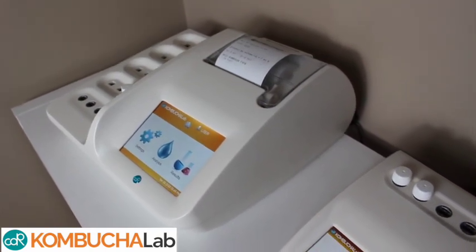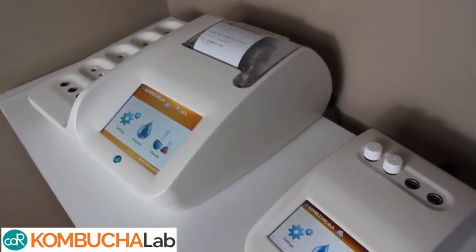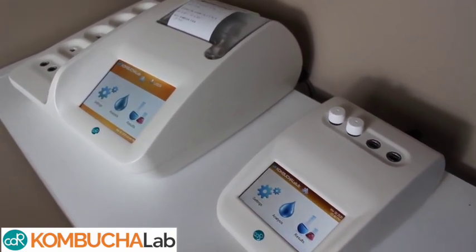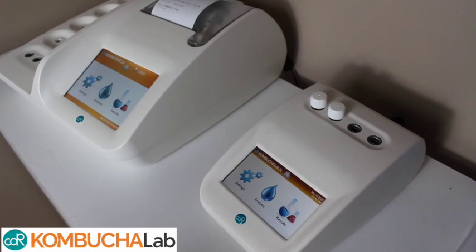This is the CDR Kombucha Lab, the innovative, easy, and reliable way to test your kombucha from start to finish to ensure quality and taste.